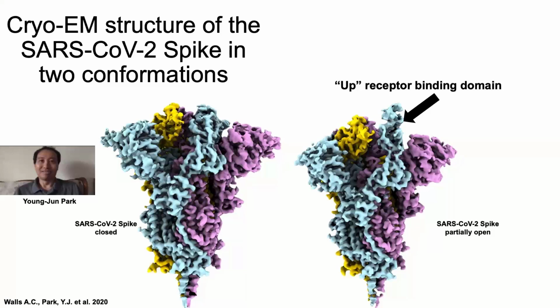In some instances, having an antibody fragment helps stabilize this segment, and in some instances, it gives it even more motion. So it's a mixed bag whether they help or hurt certain zones, but extensive classification and focused classification is our friend here.